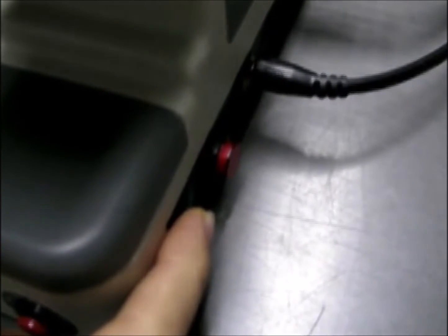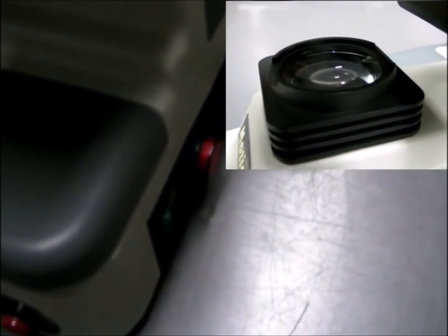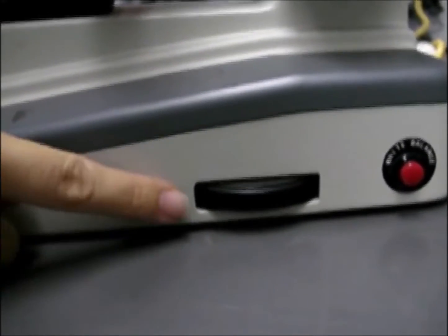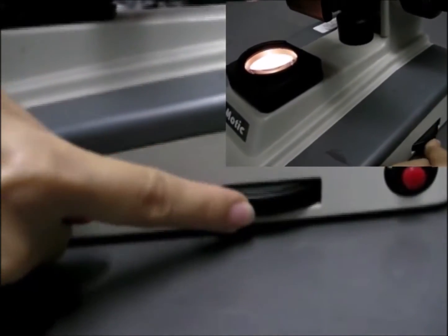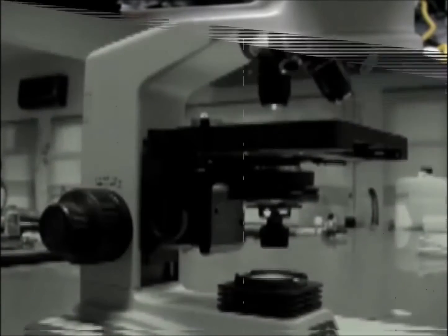This is the switch to turn on the light source. It is located behind the microscope. This is the light intensity adjustment knob. When you turn in one direction, the light intensity increases. When you turn in the opposite direction, the light intensity decreases.